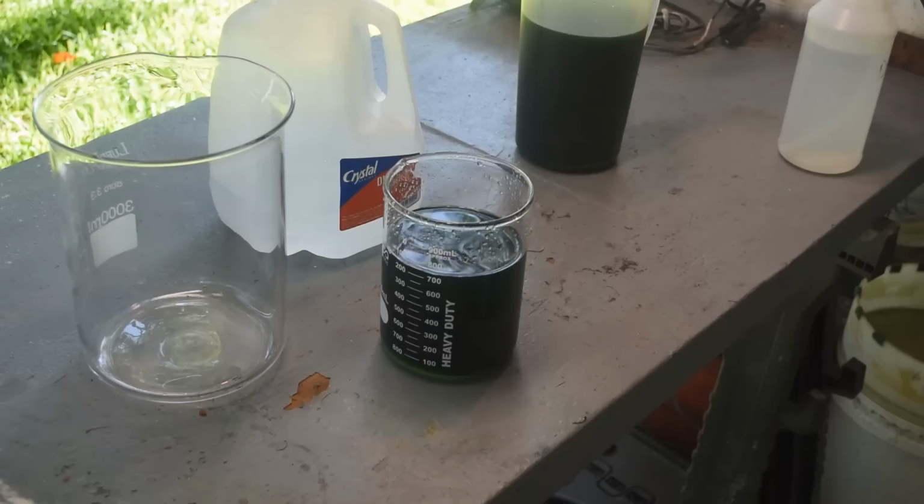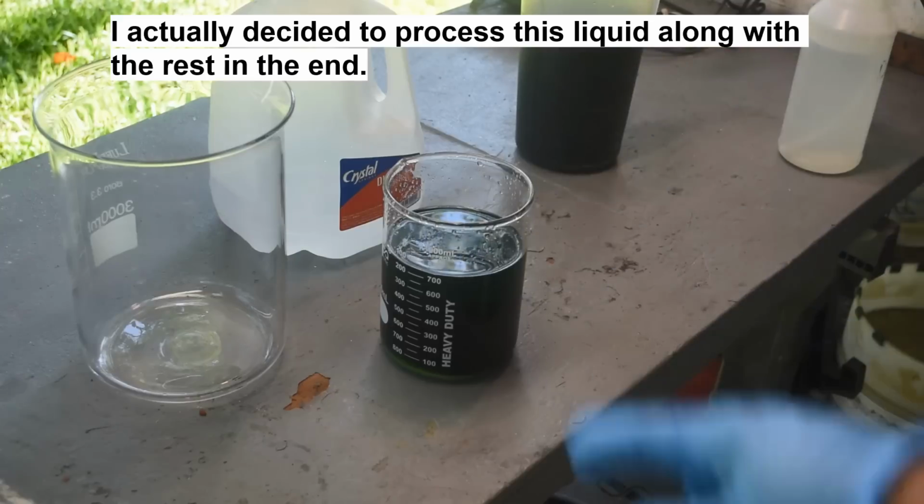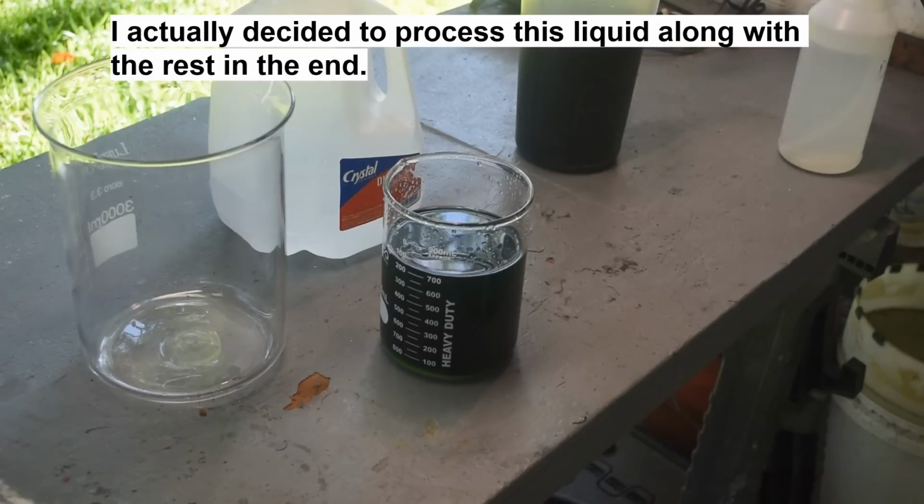But we may not get as high a yield out of this as I was hoping, just because of, well, my mistakes. But none of the palladium is being lost. Some of it's just going to be gotten in the distant future when I process my stock pot again.